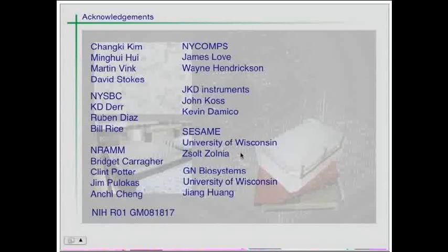That is done manually. So the grids are sitting on these magnetic trays. You need to take them one by one and put them on the tray. And then you leave it for 3 days. And after 3 days, you have some hundreds of images that you will have to evaluate.